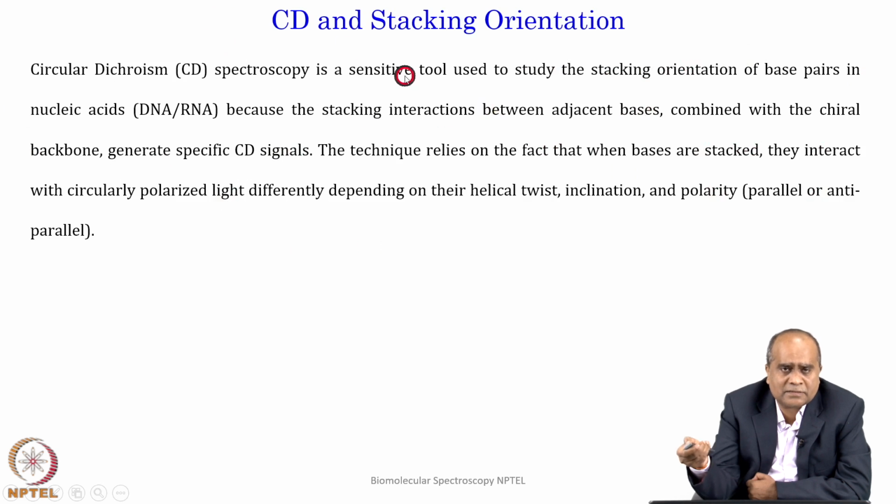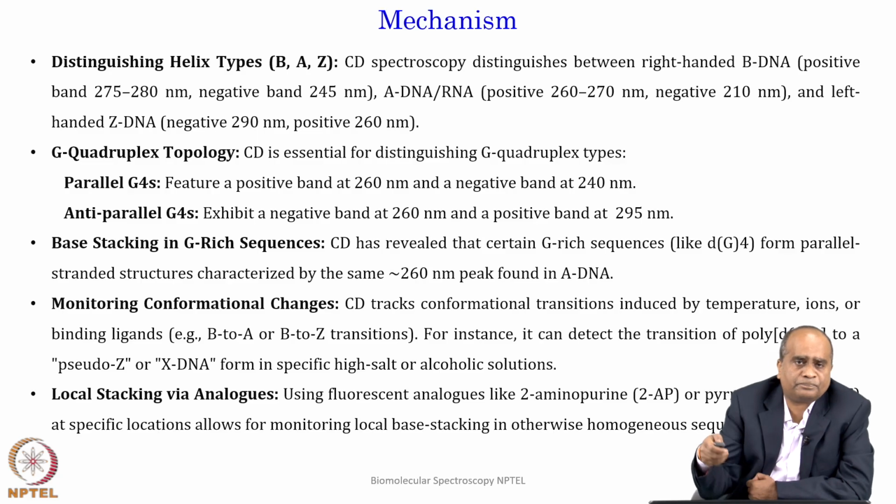This CD technique relies on the fact that when the bases are stacked, they interact with circularly polarized light differently depending on the helical twist, inclination and polarity, and that basically determines the base stacking and orientation.